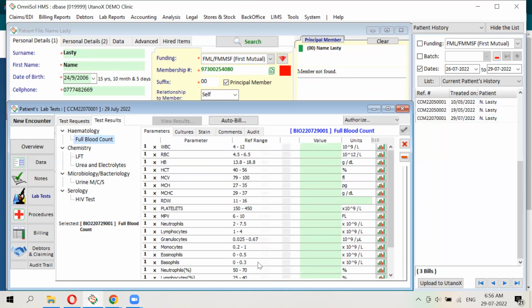The reference ranges, even though they are preloaded in the system, part of the setup steps when we deploy the system to your lab is to actually configure the reference ranges and units which you actually use in your lab. Of course, it allows you to define any units and any reference ranges. These are fairly reasonable, as they are typically what's used in the labs in your region. But of course, there would be differences because of selection of things like units.